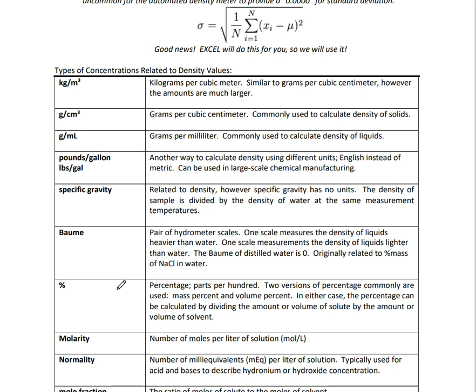So for instance, if I'm in the beer manufacturing process, I'm probably doing density, and they probably do something other than grams per milliliter as the lingo that beer manufacturers know. If I'm in the winery section, right, I'm making wine, I'm producing wine, I'm fermenting wine, I'm bottling it up. Well, there's probably a certain way that we report density, and it might not be the scientific laboratory way. It might be their own units that they like to talk about and they like to discuss.